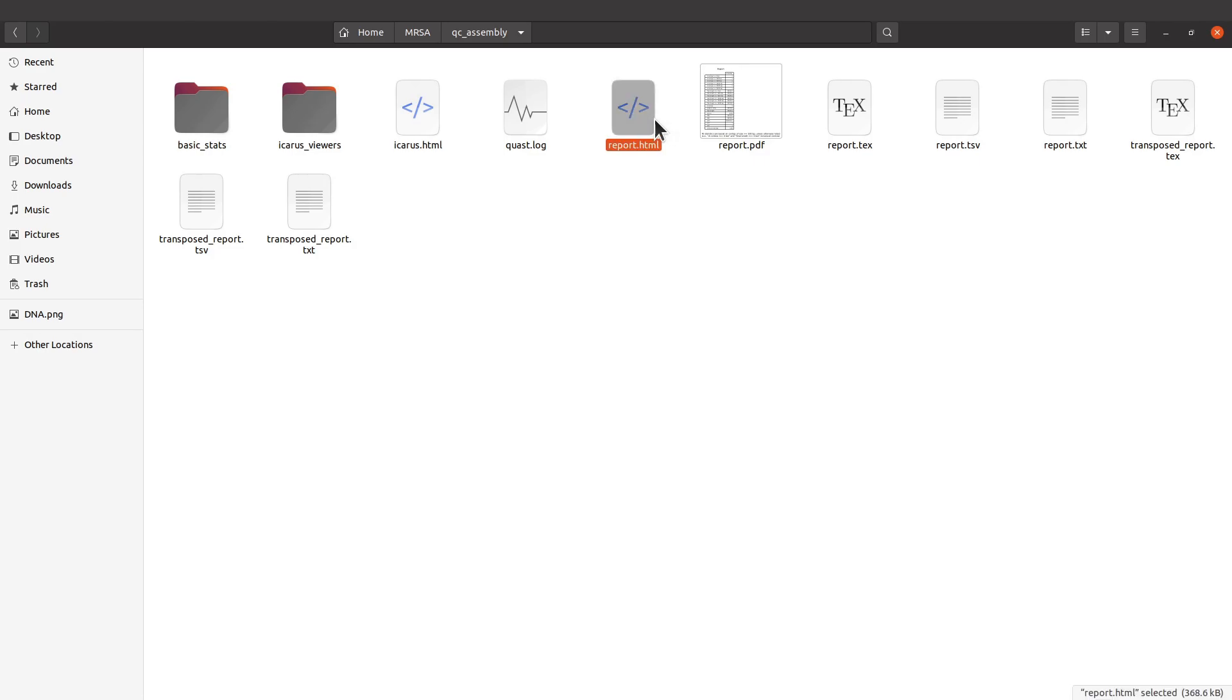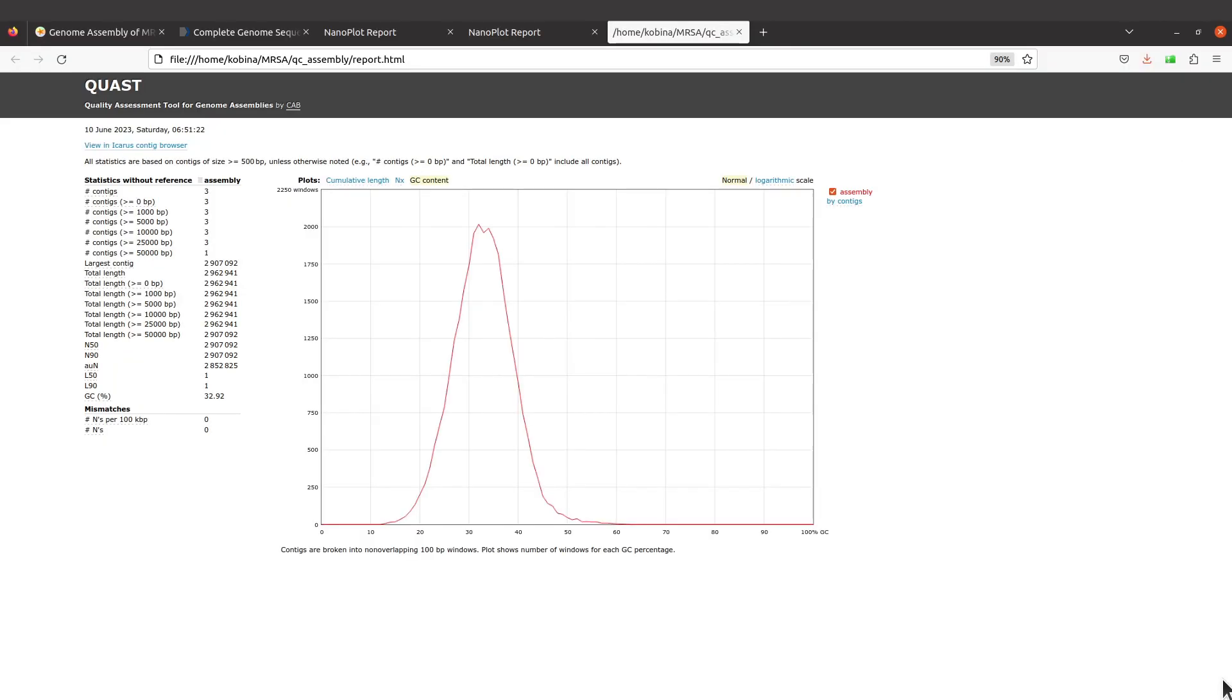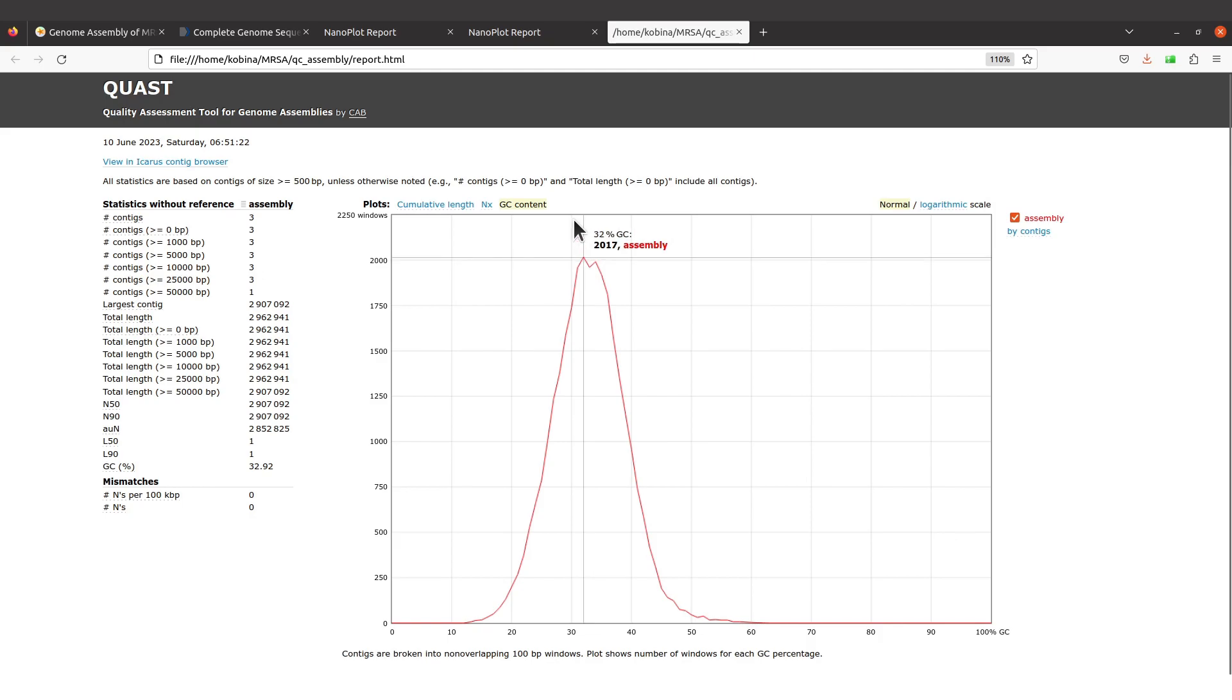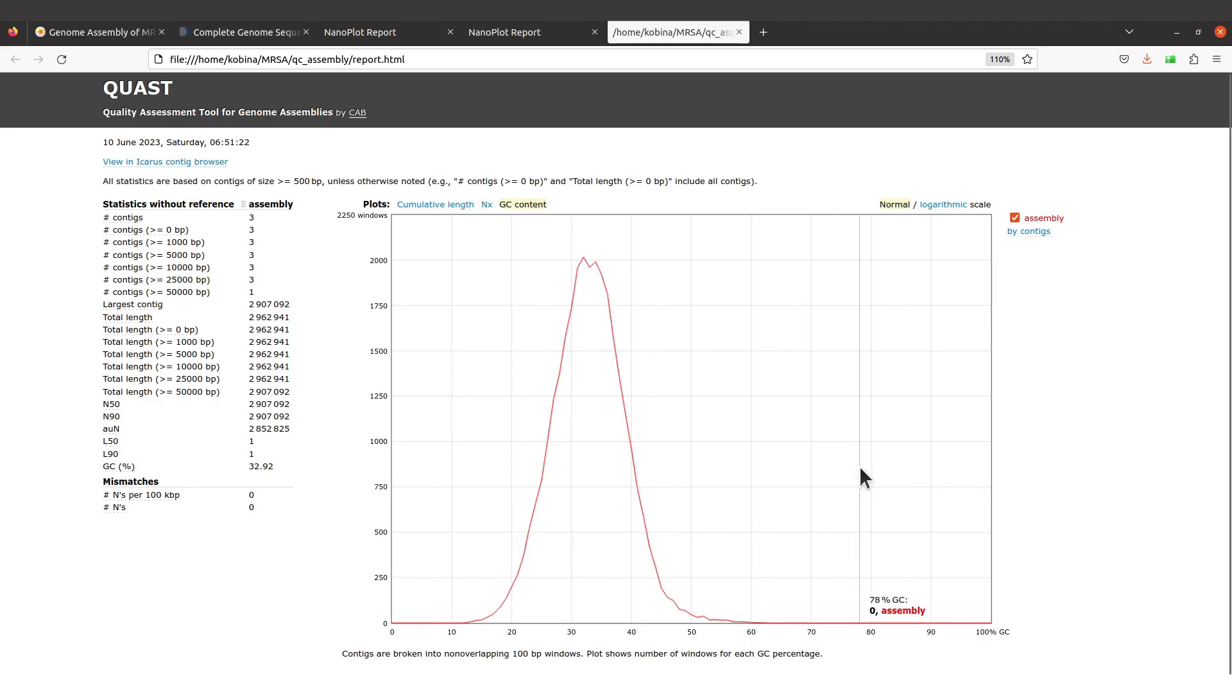There's a report in HTML which you can open. Let's open that using our browser. The report has been opened. Let's enlarge the display. We have the measurements here and we also have some plots here.